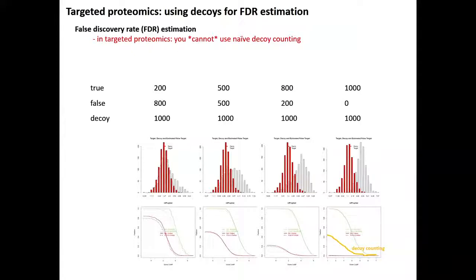And the point here, and this is the whole concept of multiple testing hypothesis corrections, is that these huge red decoy distributions you should not consider as such, but you need to scale them down, if you think about it like a scaling, until the level that it fits the false target sections of your target distributions. I don't know if you can see it on this picture, this is the dotted line here that you have in each of these plots. You have to imagine that you scale down the red decoy distributions until it fits the gray distribution on the left side.